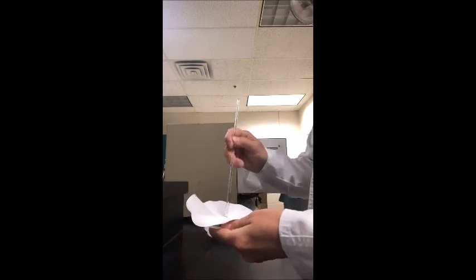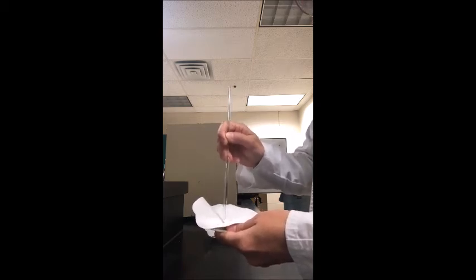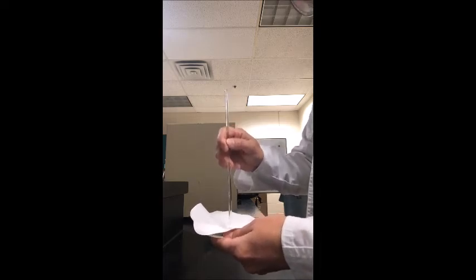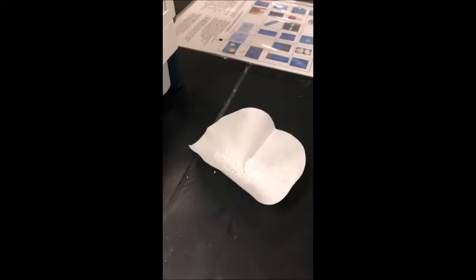Okay, so before we can find the mass, we will need to break it up. It's been drying out for a little while. Break up the precipitate using the stirring rod or some other, I guess you could use a spatula to break it up in little pieces. Make sure that it's completely dried out. I'm gonna let it dry a little bit more, and then we will find the mass afterwards. So you have to break it up in little pieces. We'll put it back in the oven, let it dry out some more, and then we will find the mass.